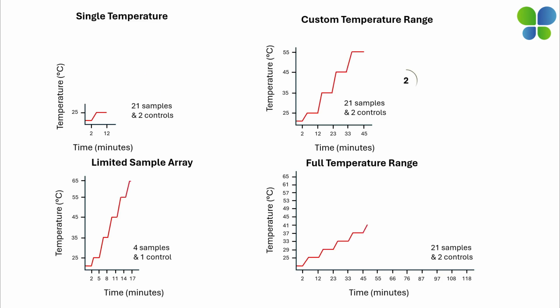The second, a custom temperature ramp which in just 45 minutes evaluates 21 samples and 2 controls. The third, a custom temperature ramp with a limited sample array of 4 samples and 1 control, ideal for rapid exploratory evaluations within 17 minutes.